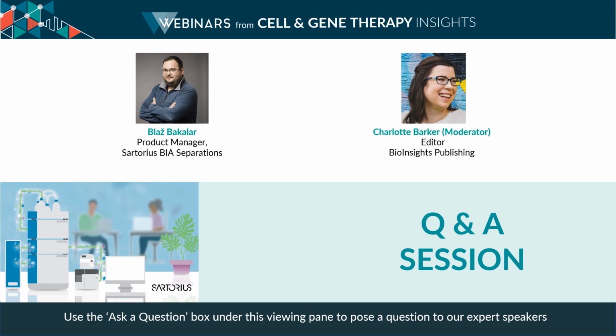Brilliant. And another question here, is there any analytical method for measuring full-length transcript? Again, I think we touched on this already, but yes, the full-length transcript will, of course, have a poly-A tail, usually, if the poly-A tail is included in the template as well. It's very easy to do it with the oligo-DT analytical method. Absolutely. And methodological question here. What percentage of Triton X do you use to disrupt the encapsulated mRNA? Yeah, I won't answer that one. Next question, please.